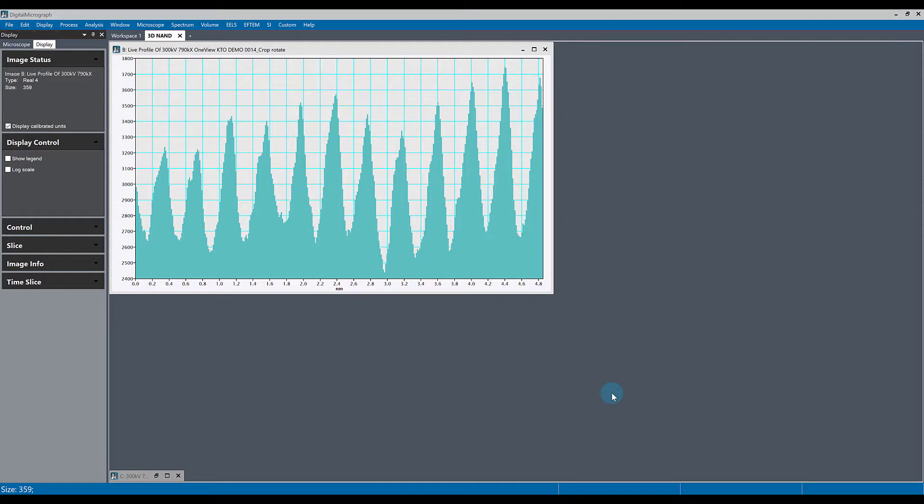If you're working with a line profile within Digital Micrograph, one thing you might want to do is zoom in or out onto the profile either in the X direction or the Y direction.